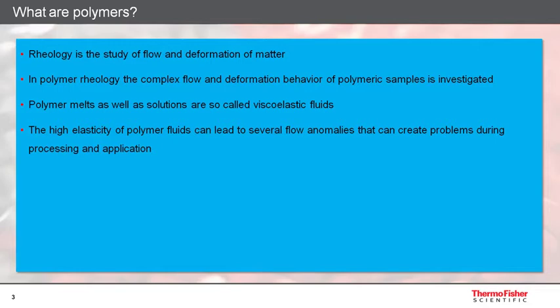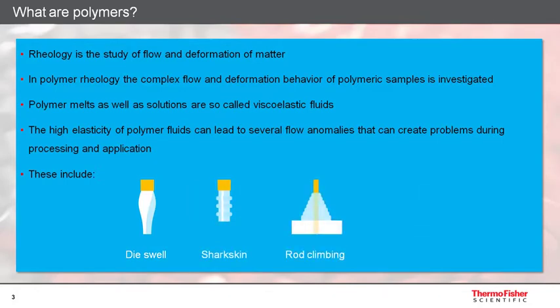The high elasticity of many polymer fluids can lead to several flow anomalies, which can cause unwanted effects during polymer processing. Examples for this are shown at the bottom of the slide. They include die swell or the formation of an uneven shark skin when the polymer is processed through a narrow die.